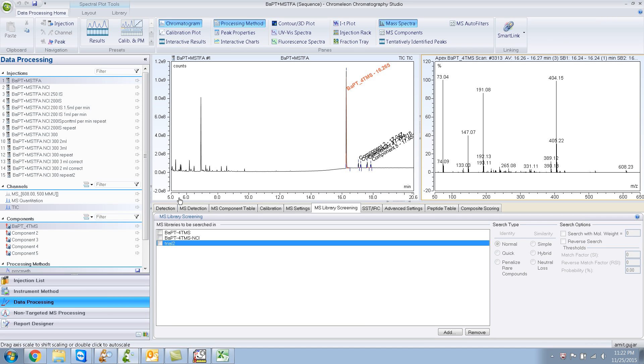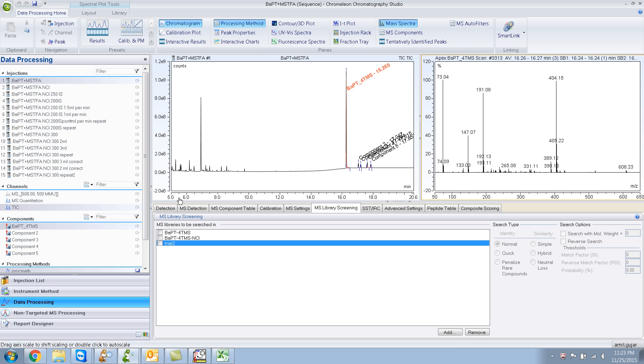So how do you create your own library? And you would need this for many reasons. One of the reasons would be that you're analyzing for this compound in your mixture, and you want to make sure that you have a good hit, like a good spectral match.